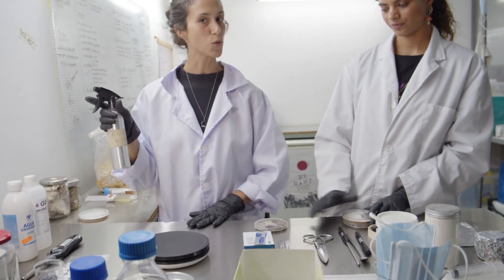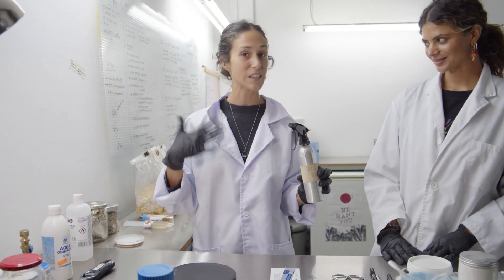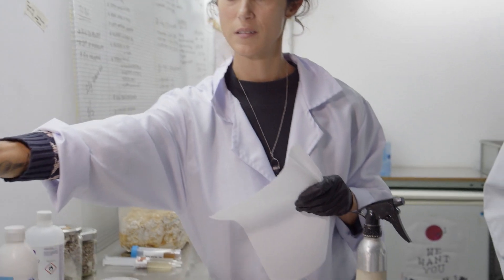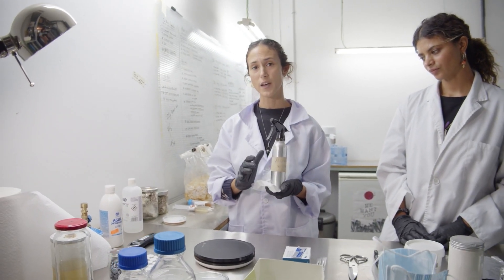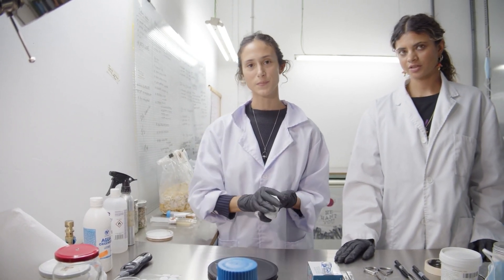We really recommend using a sterile, smooth work surface that you can clean — like a metal table, nothing wooden or porous. Use 70% alcohol to spray your hands, your lab coat or clean shirt, your arms, and wipe down your work surface using a paper towel, or spray it and let it dry so it has time to kill bacteria, fungus, or yeast.